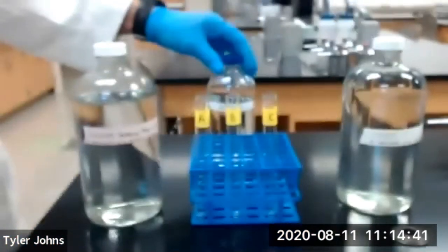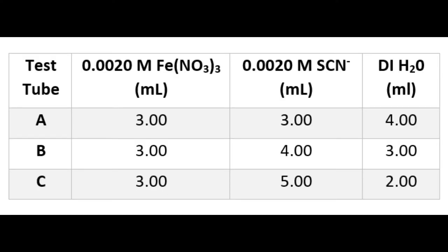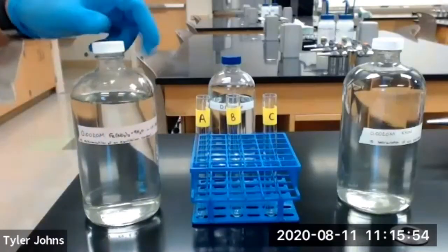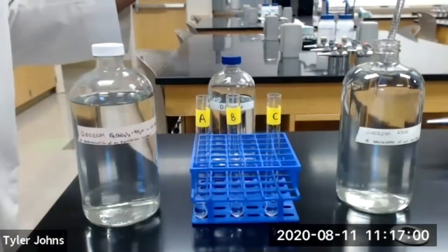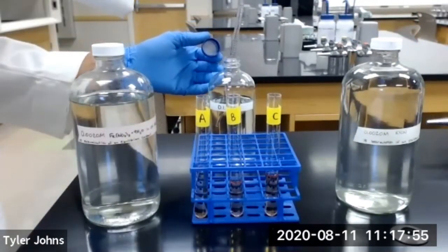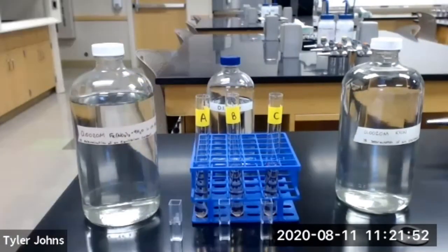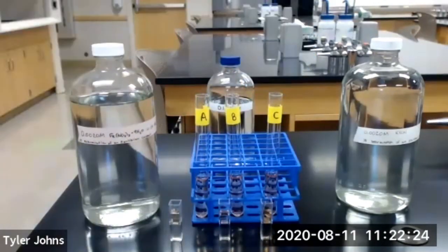And we'll prepare these 3 different concentrations according to the following table. We'll next add 1 milliliter of each of our prepared samples to a cuvette. And we'll now read our samples in the spectrophotometer.